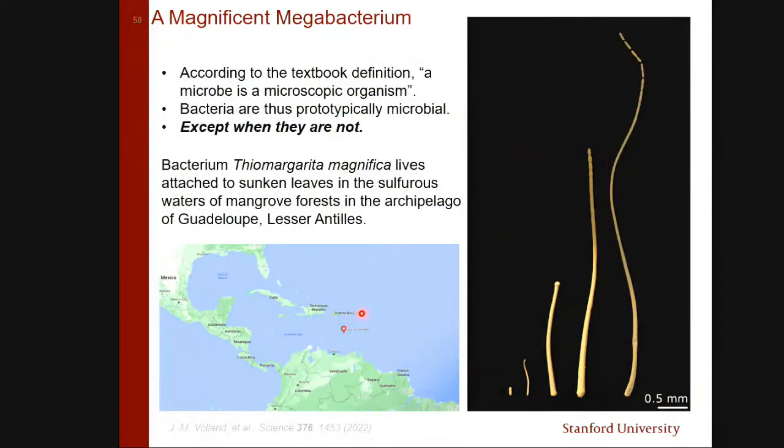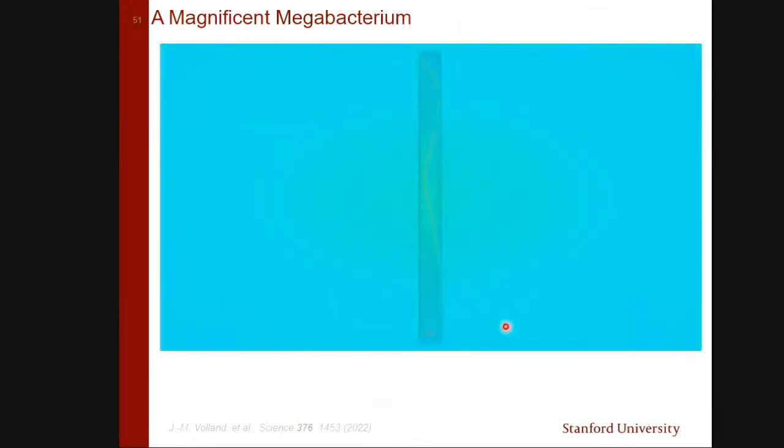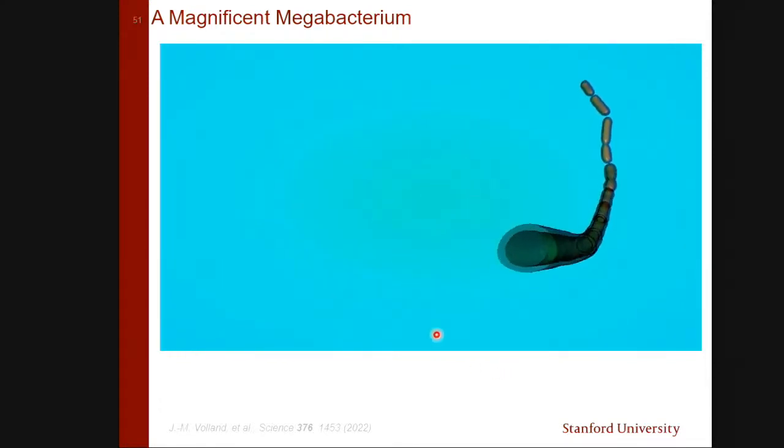So they were found somewhere in Guadeloupe, Lesser Antilles, somewhere here in the forests. And they were measured in my lab. So not only CT, but also other instruments, but CT, that's what I like. So that's what I actually helped them with. So this is one of the bacteria encased in some epoxy. And after the collection, you can do something interesting. So 6.3 millimeters, centimeters, I think. And then you can slice it and see through this bacteria.